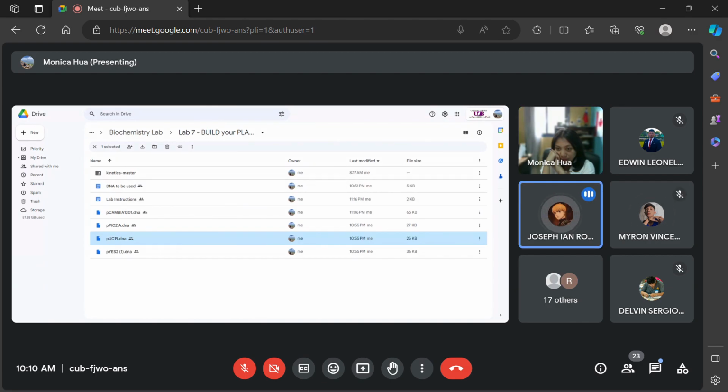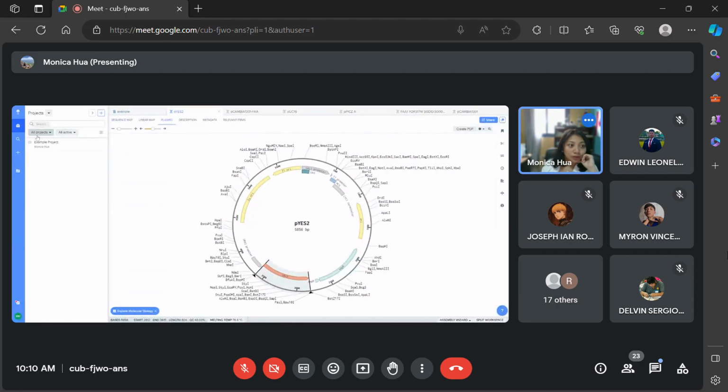Miss, just open all of them on Benchling, right? Yes, import them. So let me show you guys. To import them, you would click the plus button on the left-hand side called Create. So you press the plus button, you go to DNA/RNA sequence, you go to import DNA or RNA sequence, and then when you click that, I'll just share my entire screen. Hold on.